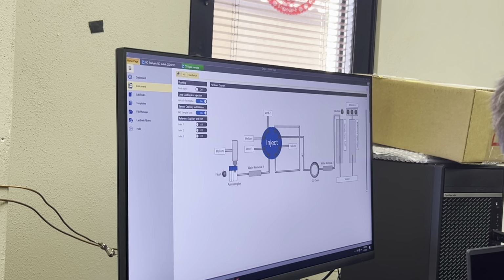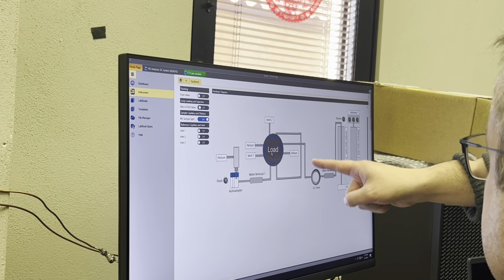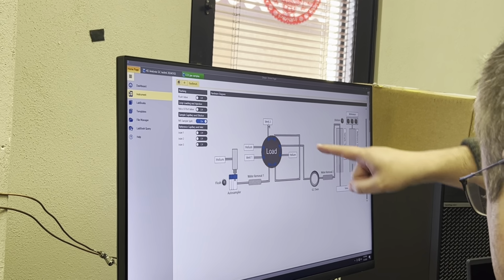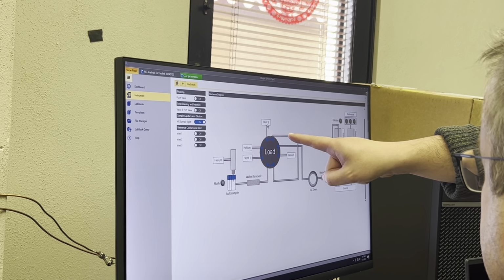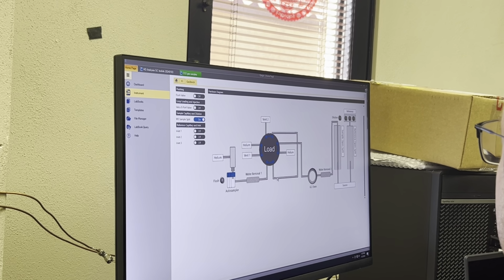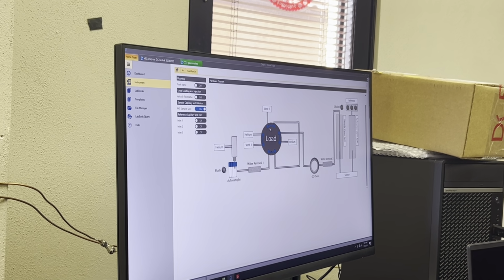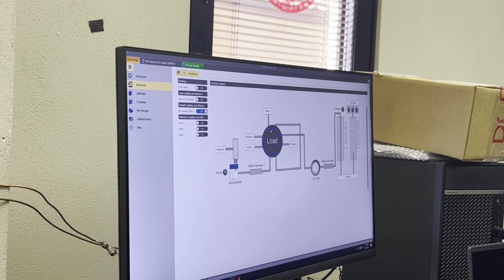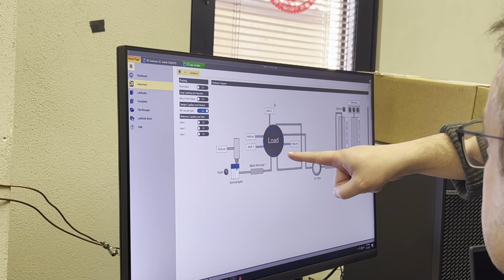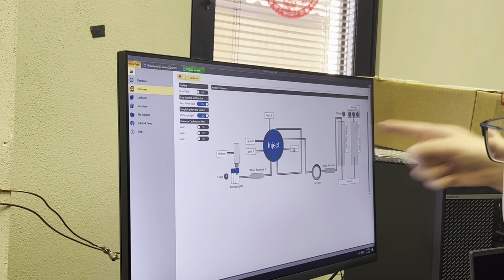In the load one, you're pushing material through this and basically just filling this up, so that when you switch it, it'll continue on through here. But while it's in load phase, is it going to vent out and you're going to lose some sample? You're going to put more than 100 microliters through that, maybe 150 microliters. Once this is full and you switch it to inject, what is the mechanism that continues pushing this now that you're not connected to this? It's this helium. You've got a different helium flow.